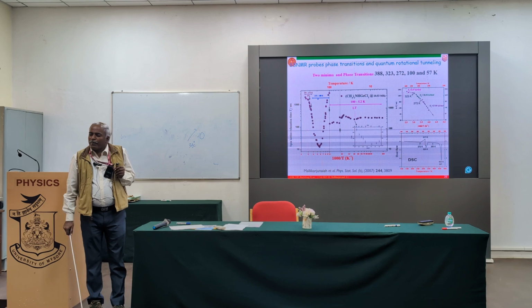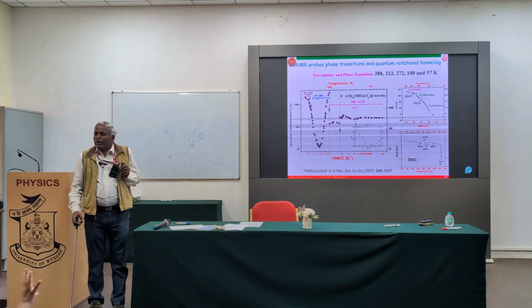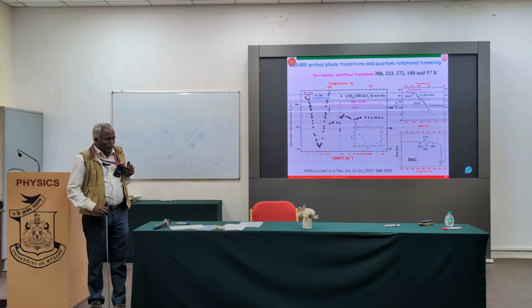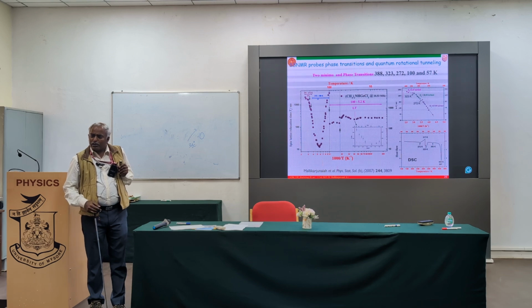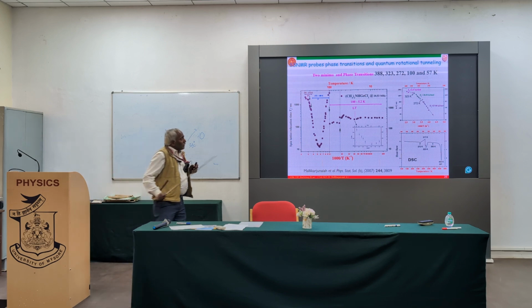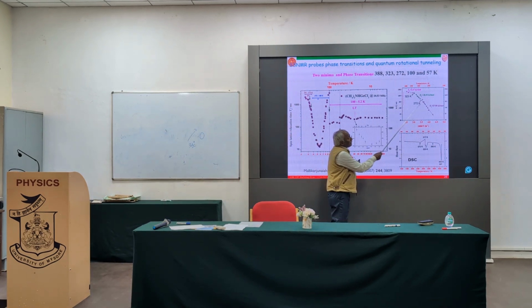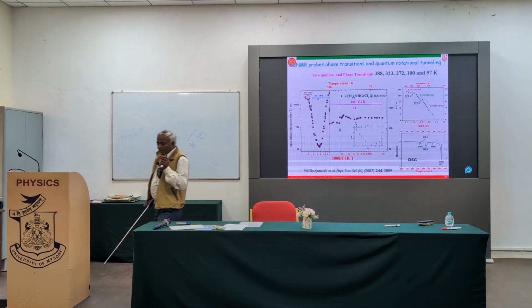Yes. Generally, when you speak about keeping it constant and varying the field, whatever slight variations you are observing could be because, in practicality, you cannot keep the magnetic field completely homogeneous. Right? Yes, so that could also be the reason. For that we pay more attention whenever we make the measurement. The field homogeneity is the key point.